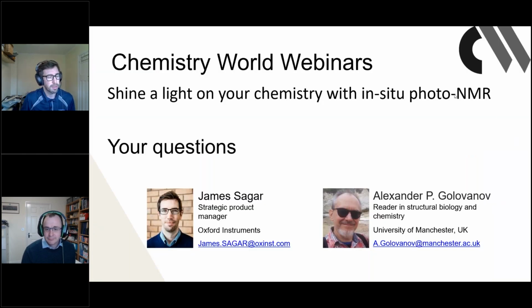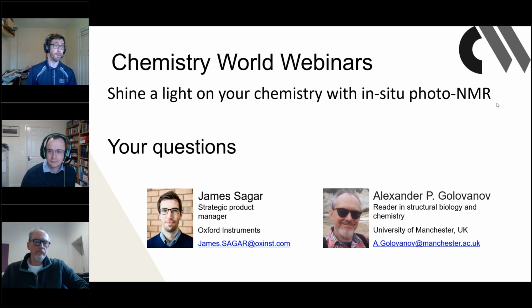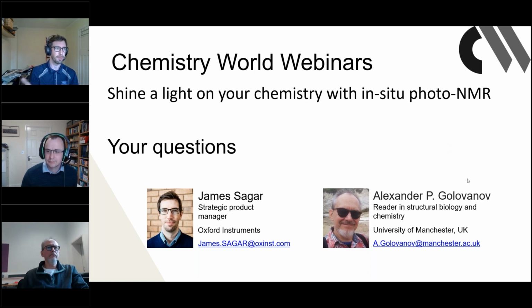Well, I think it's very nice to see that people are obviously interested in using this with benchtop NMR as well as high field. I think it's obvious that people want some corroboration of their data across the two quite different techniques, although they're complementary and they use the same sort of physics to generate your signal. The data you get is actually quite different in many ways. But it's really nice to see that people want to use this technique, and that more people maybe want to use it on the benchtop rather than just on a high field.